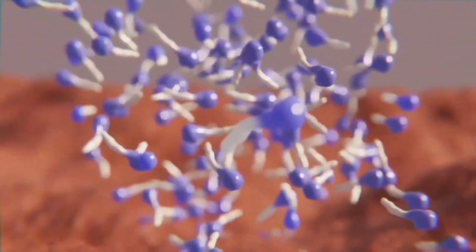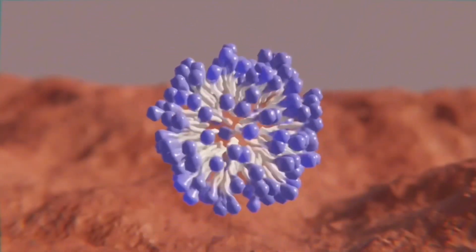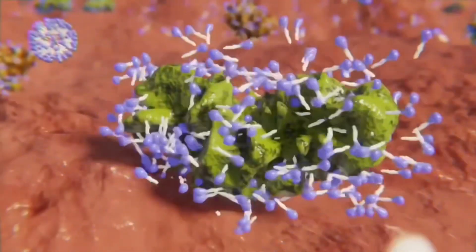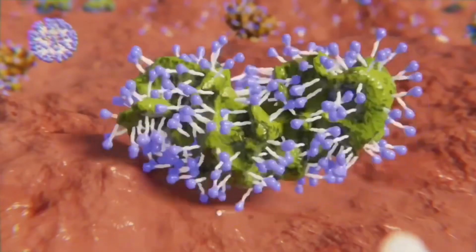Thus, as the saponification continues, the soap molecules form a structure that is bound together. This structure is what gives the soap its hardness and solidity.